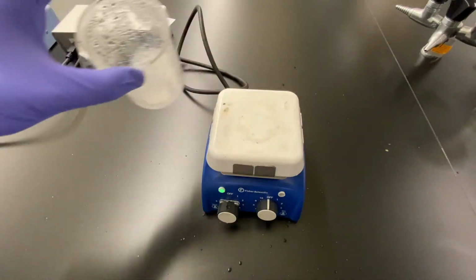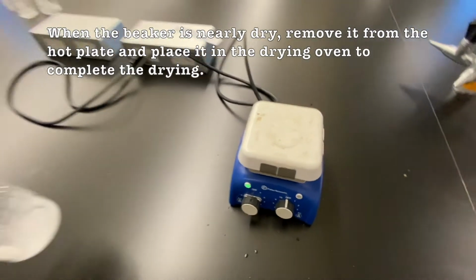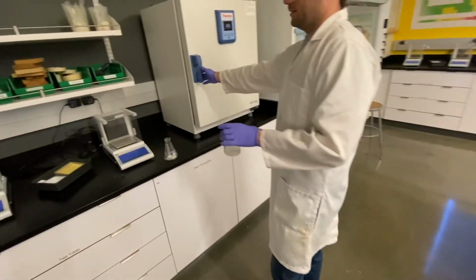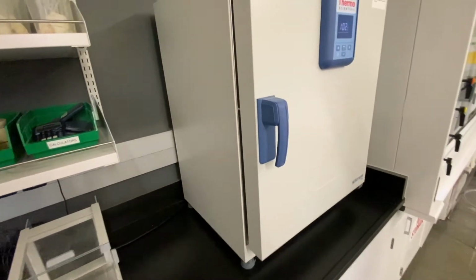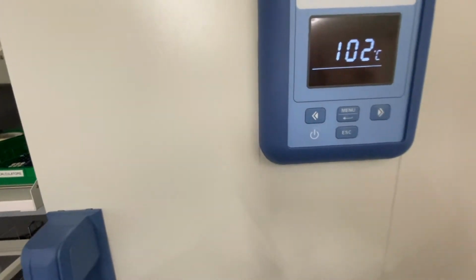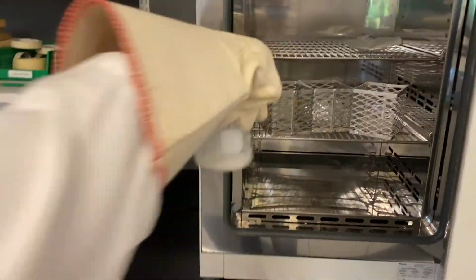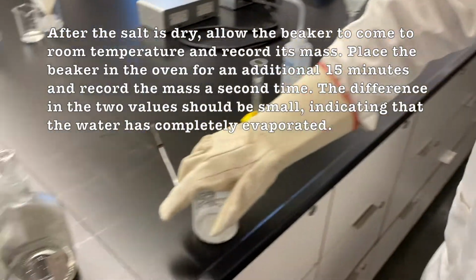And just a little quick fast forward. We've boiled off almost all of the water. And so we're going to put it in a 100-degree oven to get the water to come off a little slower. If you leave it on the hot plate when almost all the water is gone, you can have a reaction happen with the salt and the air, which we don't want to happen if you get it hot enough. So this slowly lets the water off. It's obviously a time lapse. And so now our beaker just has salt and a beaker.